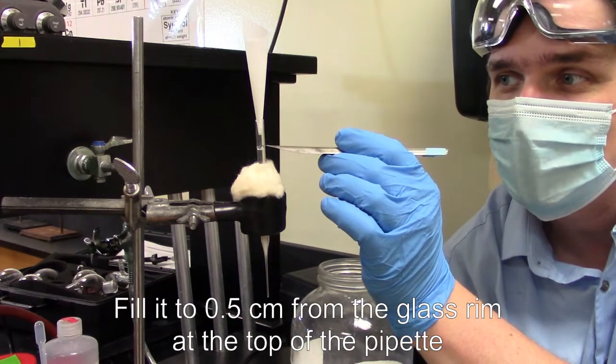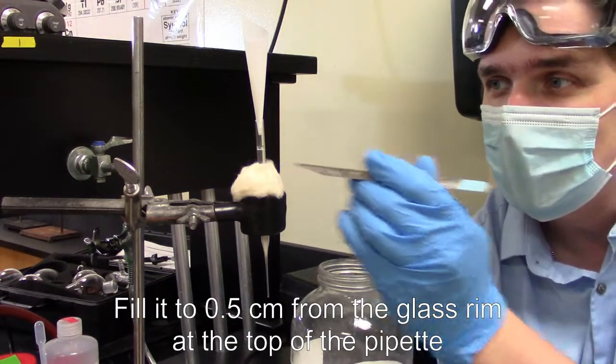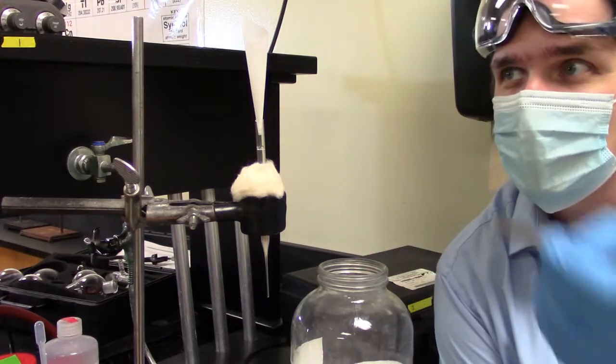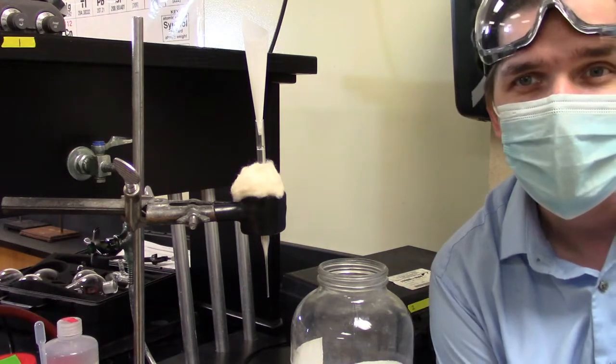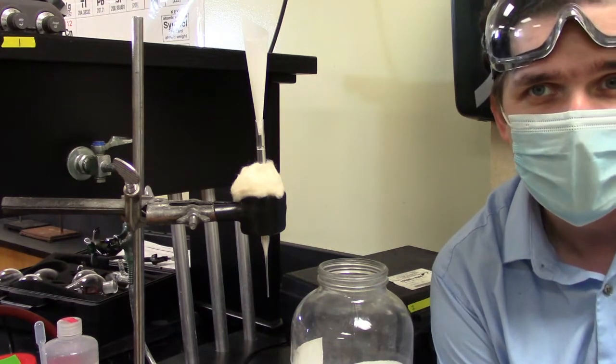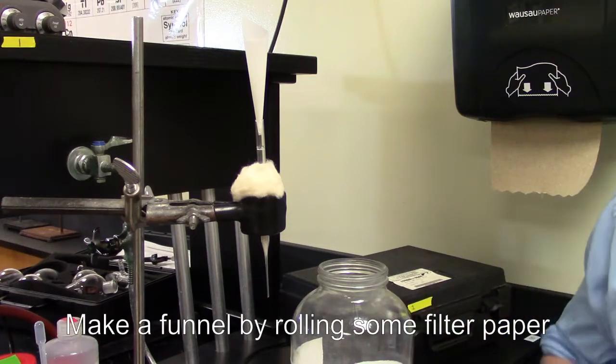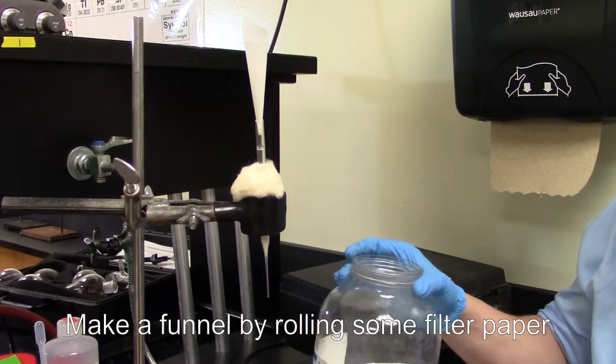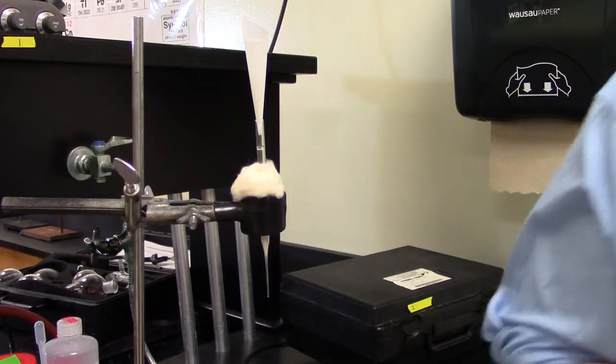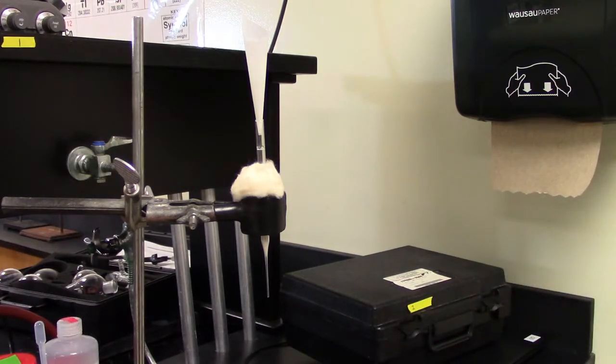Now, we're going to fill it to roughly a half centimeter beneath where we plan on stopping the column. Now, the nice thing about the Pasteur pipettes, there's usually a glass ring in there. So we're going to fill it to half a centimeter below that. And to kind of help with this process, I've created a funnel using a piece of weighing paper. I wasn't so worried about that with the sand before because it's just sand. This is actually silica gel. And so I'm a little bit worried about basically spilling the silica gel.